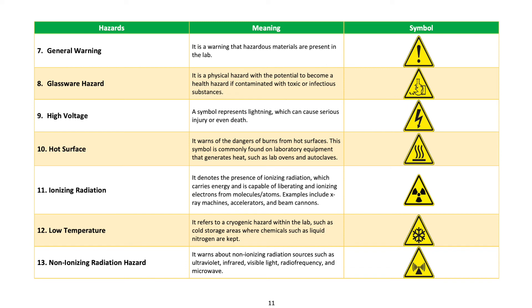Ionizing radiation: denotes the presence of ionizing radiation, which carries energy and is capable of liberating and ionizing electrons from molecules or atoms; examples include X-ray machines, accelerators, and beam cannons. Low temperature: refers to a cryogenic hazard within the lab, such as cold storage areas where chemicals such as liquid nitrogen are kept. Non-ionizing radiation hazard: warns about non-ionizing radiation sources such as ultraviolet, infrared, visible light, radio frequency, and microwave.